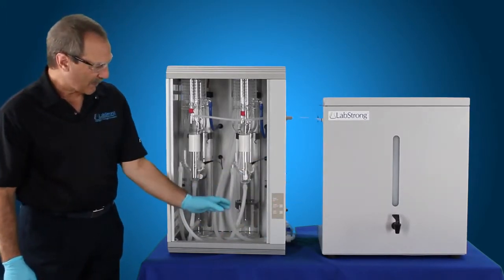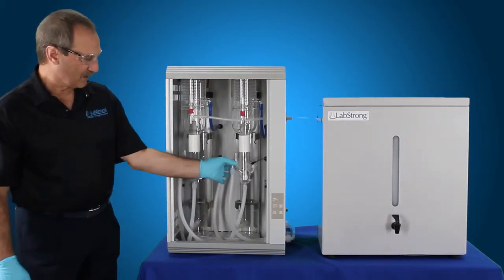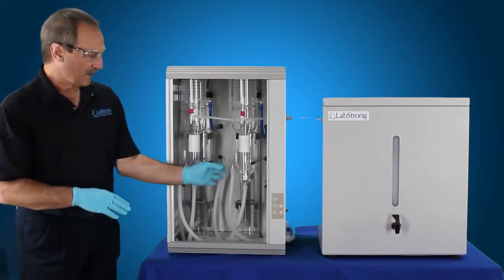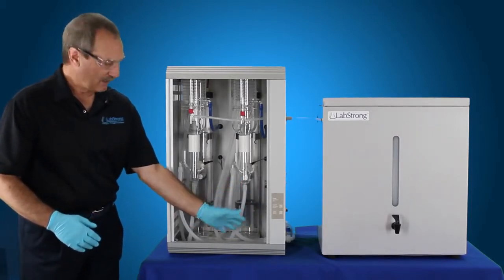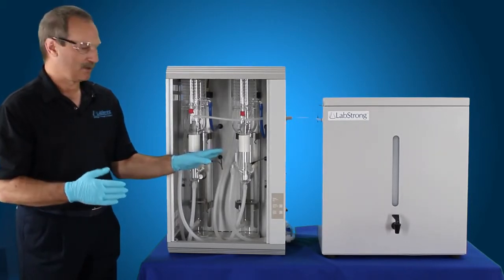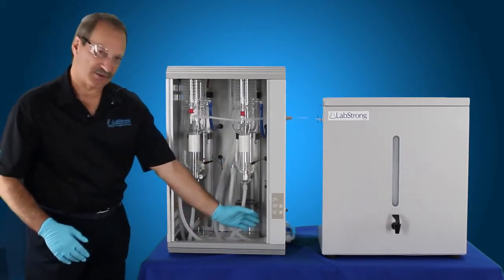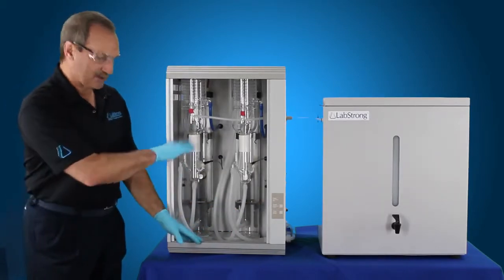Once that's drained out, it times out for four minutes, then it refills both boilers again until it hits the thermistor on each one, then it shuts the fill solenoid valves off and drains the water back out. Once it lets that time out for four minutes, it will refill it back up again — that's the second fill, that's the flush mode. Then that will hit the thermistors, shuts it off, shuts the inlet off, and then lets it drain back out again. That's your second flush. So it flushes it twice after you've hit the clean button to let the solution go out.